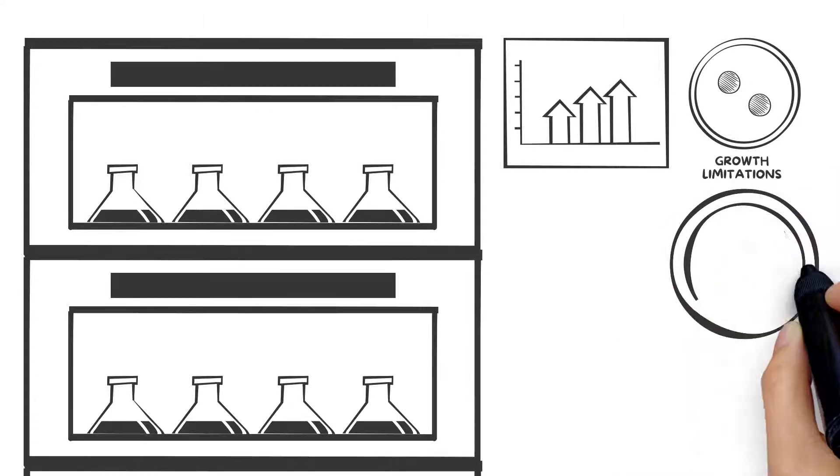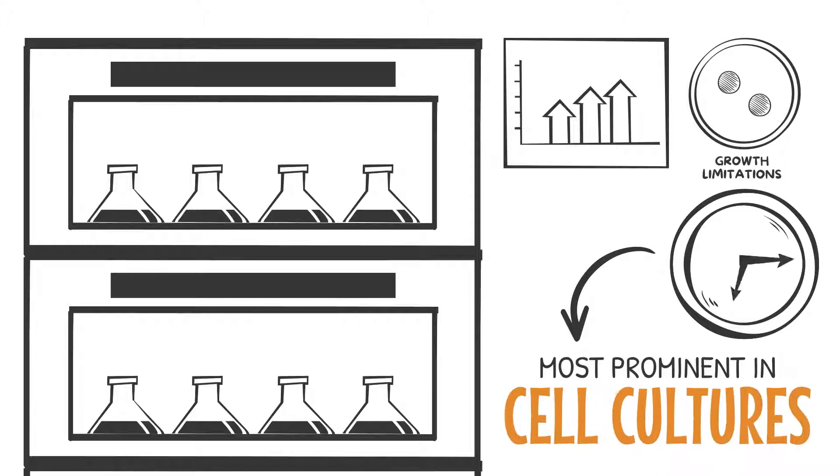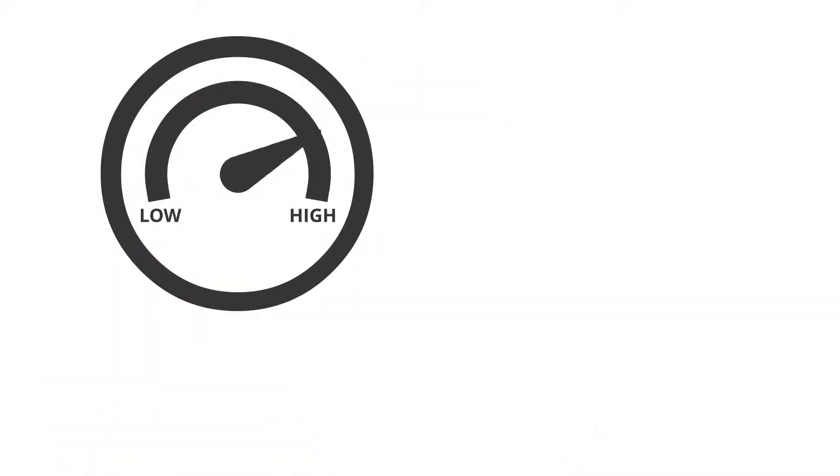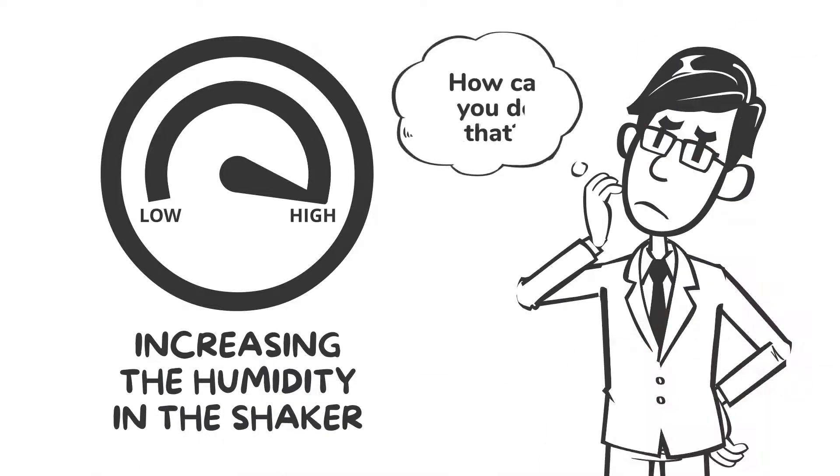This effect increases with the process duration and is therefore most prominent in cell cultures. Fortunately, evaporation can be minimized by increasing the humidity in the shaker, but how can you do that?